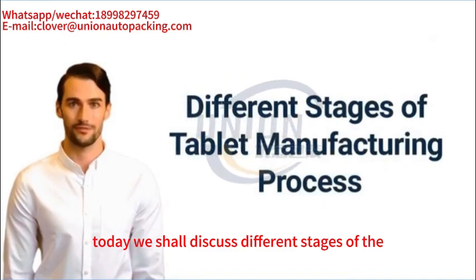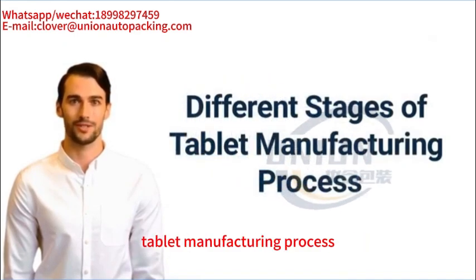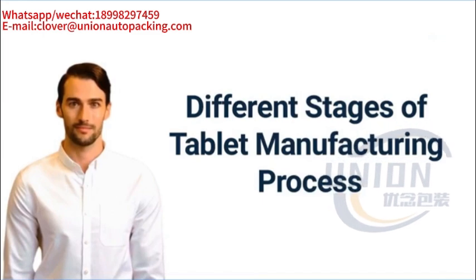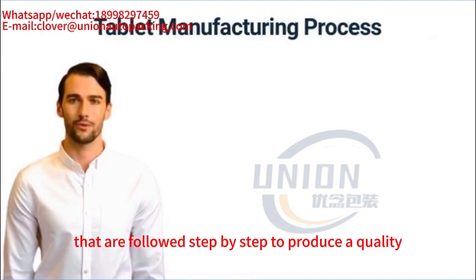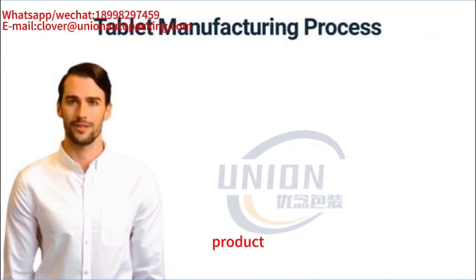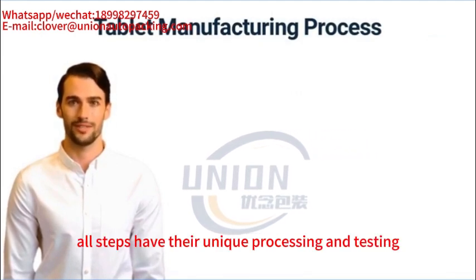Today we shall discuss different stages of the tablet manufacturing process. The tablet manufacturing process is a series of steps that are followed step by step to produce a quality product. All steps have their unique processing and testing.